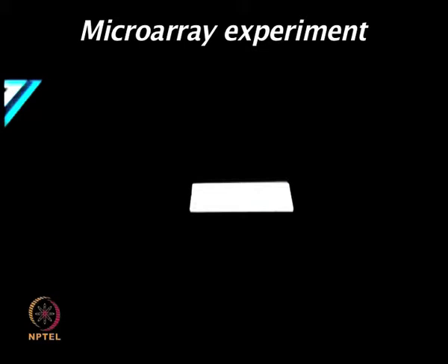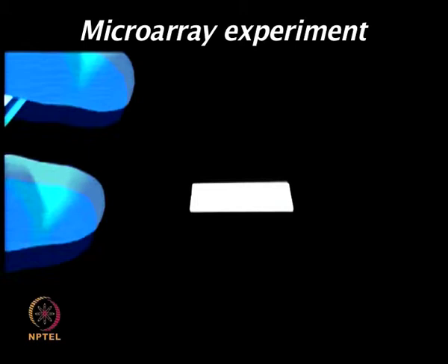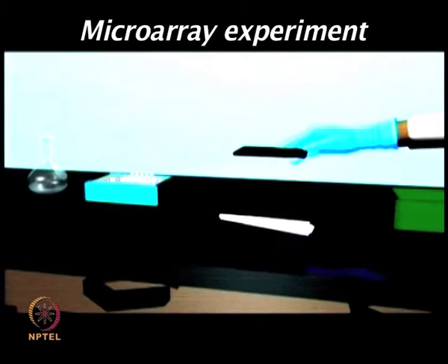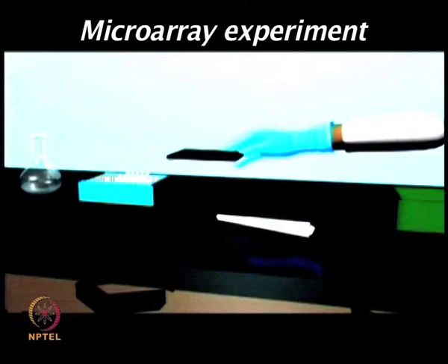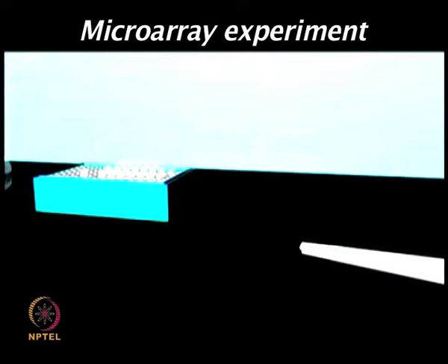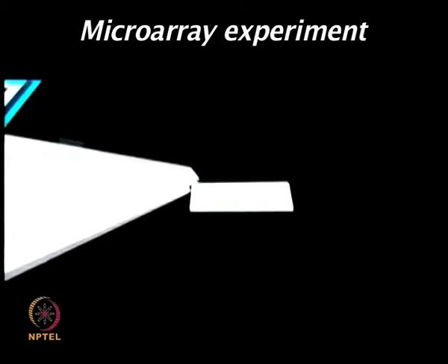Once you are ready with the appropriate dilution of the serum, then you can apply it on the chip surface and place the cover slip for an hour. Similarly, you can add the primary antibody and then place the cover slip. As I mentioned, these are generic steps which could be used for a variety of applications. So once the primary antibody or the serum is placed on the chip surface, then one needs to incubate for at least an hour.